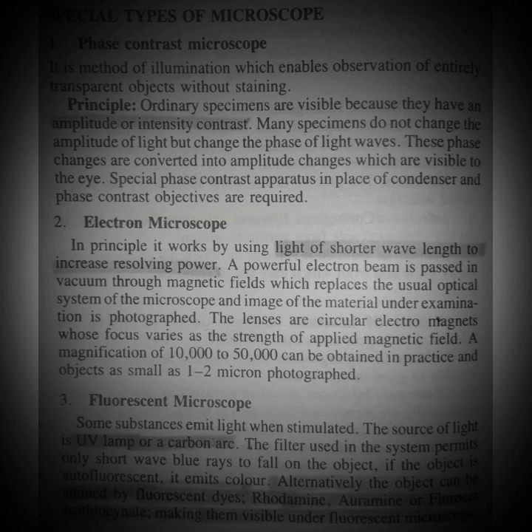And what is the function of fluorescent? Fluorescent means having different colors in it. It is of very bright color and of high wavelength as well. So this fluorescent dye, when we see it in the fluorescent microscope, will look very contrasting, very nicely. I will show you the picture of the fluorescent microscope as well. So this is all about the microscope and its parts.